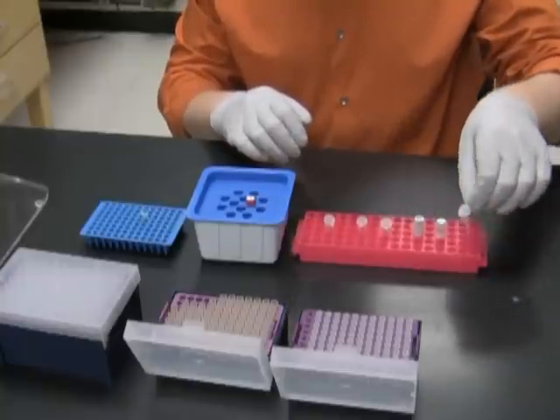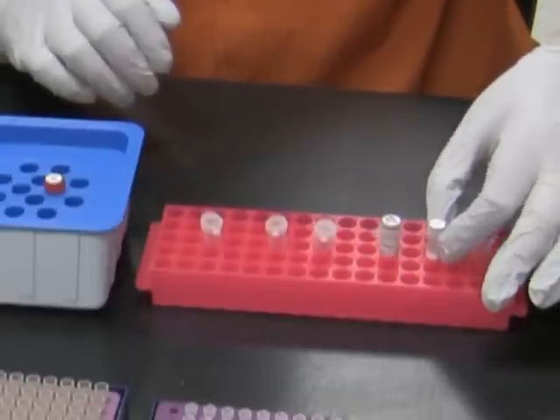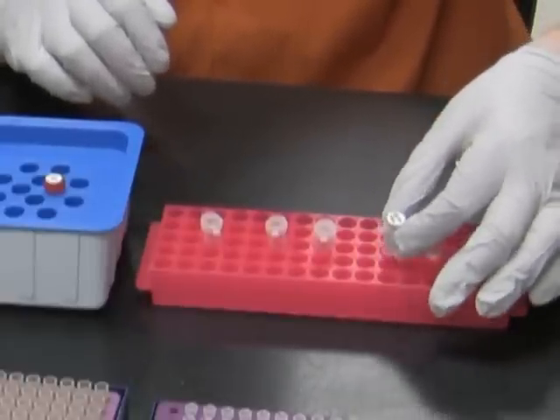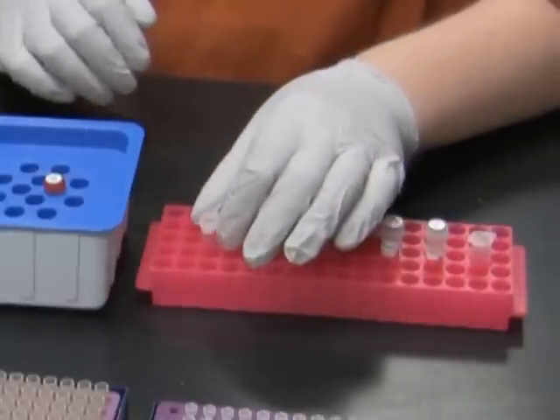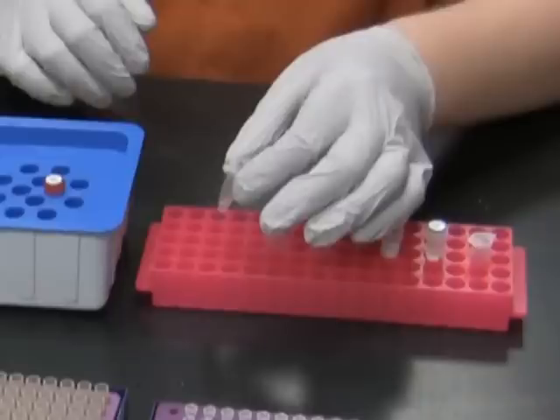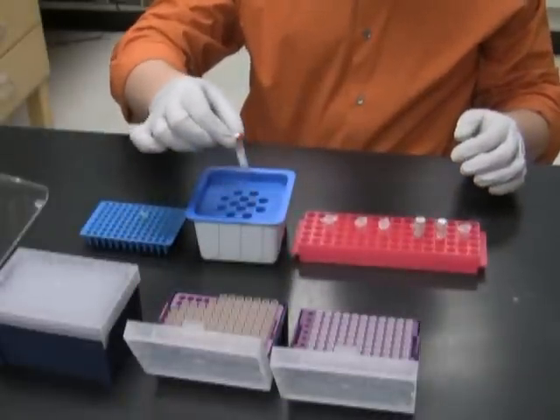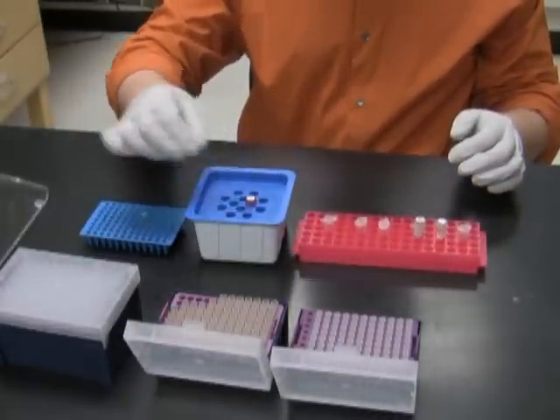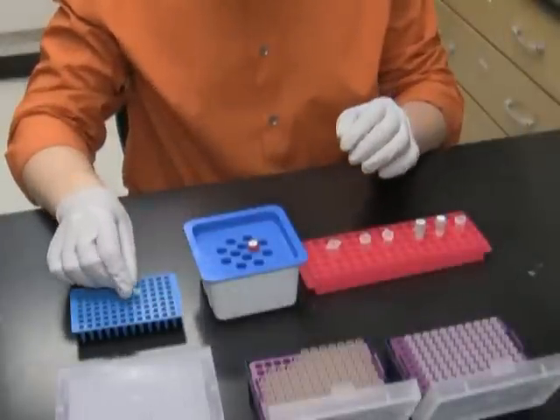Now let's get back to the bench and prepare a PCR mix. Here on the bench I have double distilled water, 10x polymerase buffer, dNTP mix, forward and reverse primers, DNA template, which is 50 times diluted miniprep of plasmid pFGC5941, a DNA polymerase, and an empty PCR tube. Now I'm going to do the pipetting.